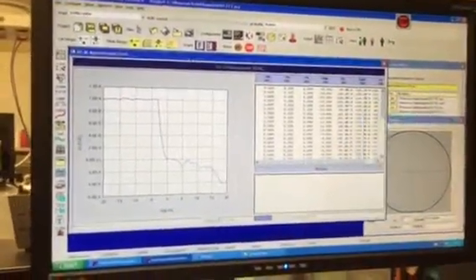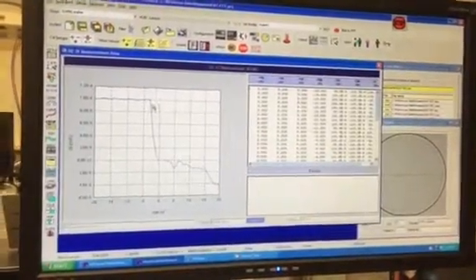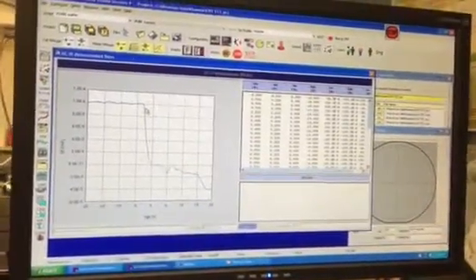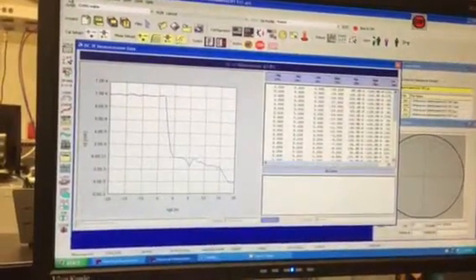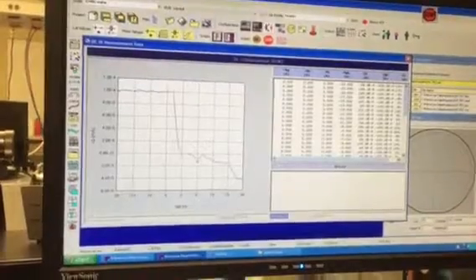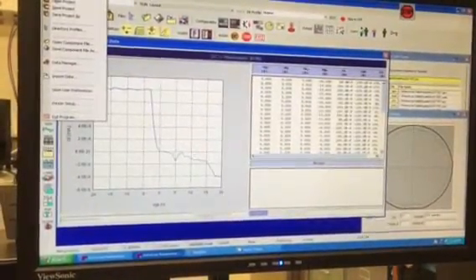So it's all done. Yeah, I think it's reasonable. Okay. So now let's do a plot. Why don't we save the data first? So in this case, let's save it. We're going to save it manually since we didn't put it into the script. Okay. So, do you remember how to save the data manually, the MEA data?